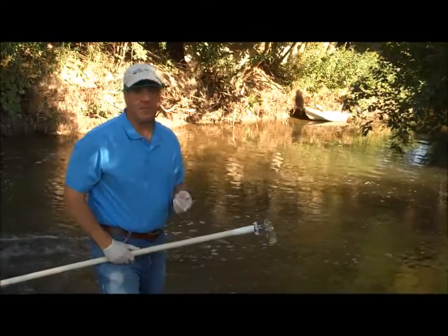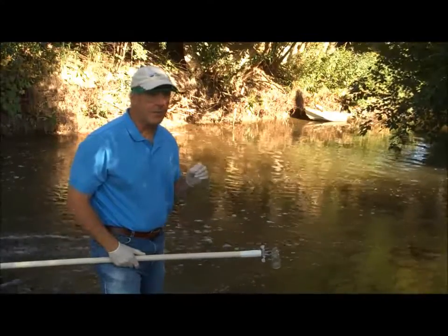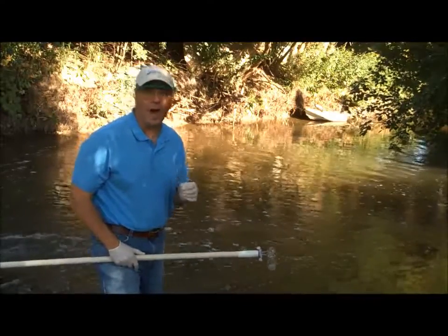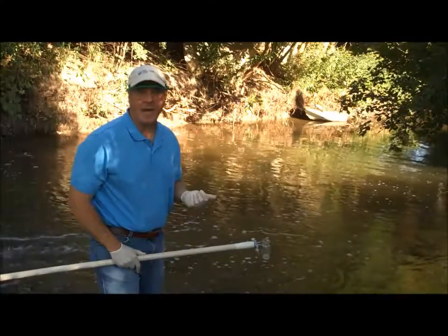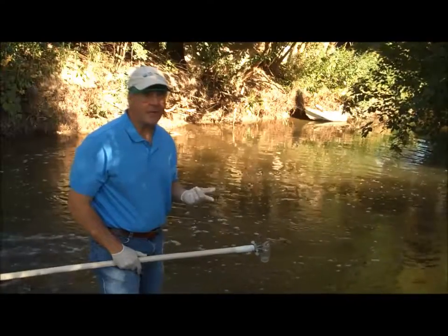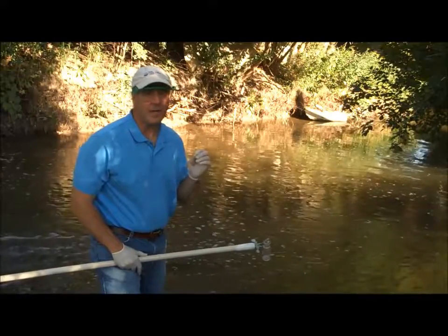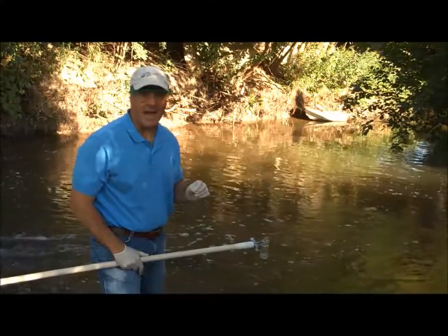The group that's going to go first is turbidity and total solids. They're going to collect water because remember, turbidity is the clarity of the water, and so they're going to be the first group to collect water, and I'll let you think about the reason why they go first. After that, we're going to have dissolved oxygen and biochemical oxygen demand get their water, and then we're going to have nitrates, phosphates, and then fecal coliform is going to get their water last, because when they're out here at the river, they're going to be assisting benthic macroinvertebrates, and their test takes place back at school.